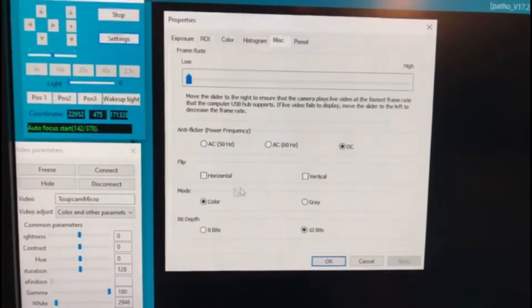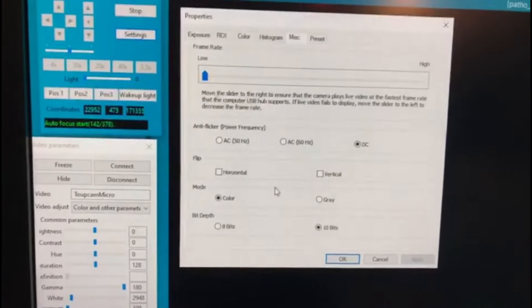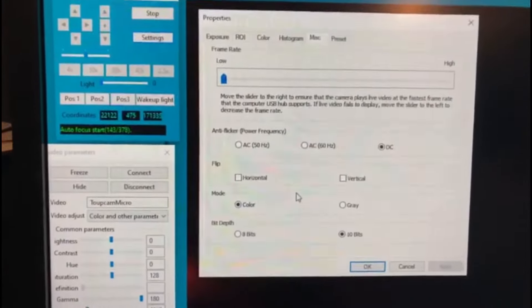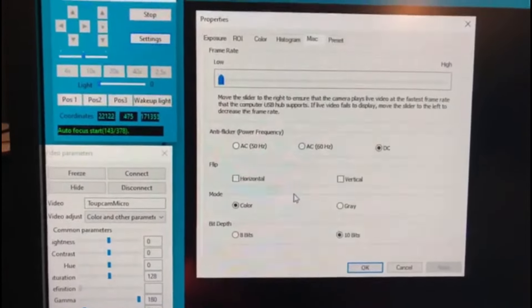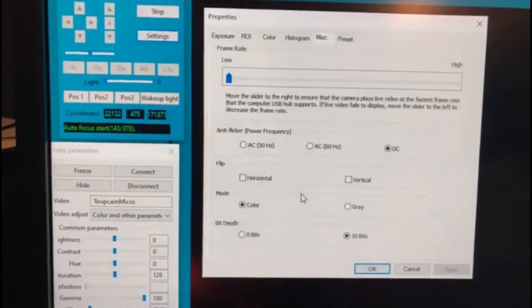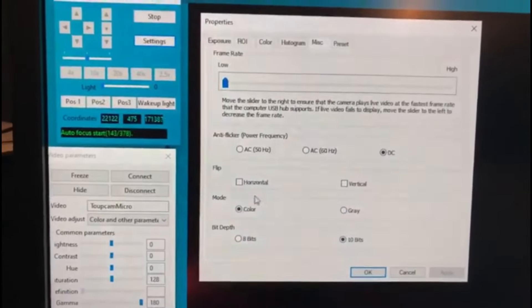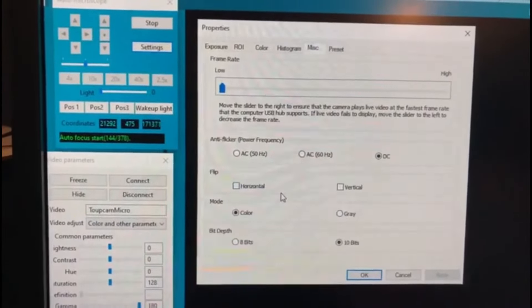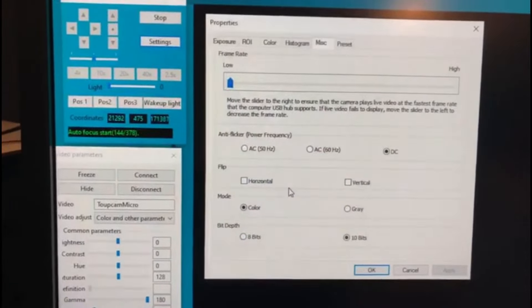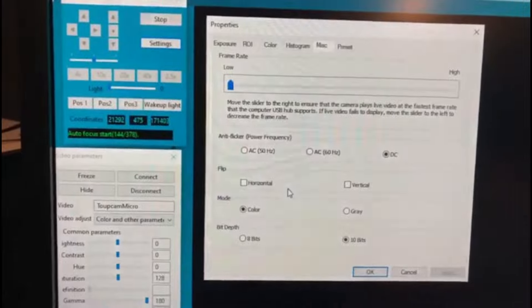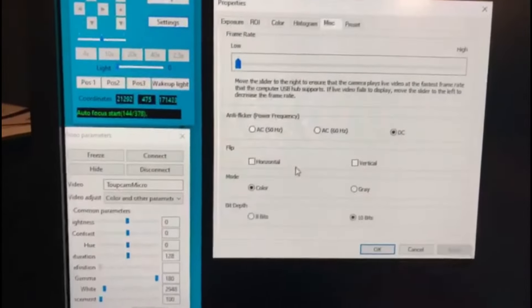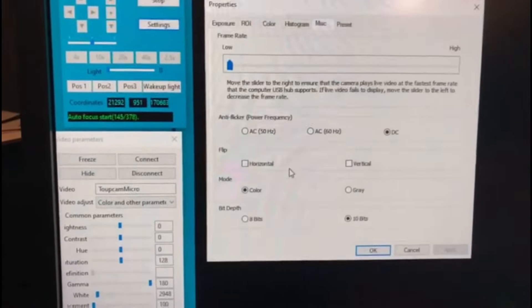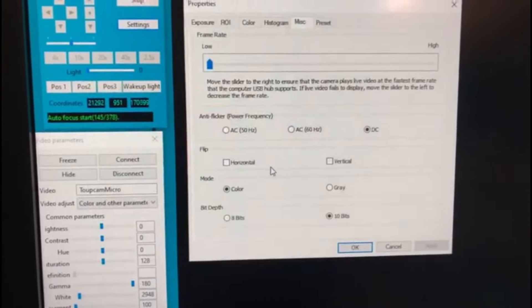Scanning is done from the bottom right up to the top left, and we are not doing any flip. The camera we are using is a 2-megapixel camera, 1920 by 1080.